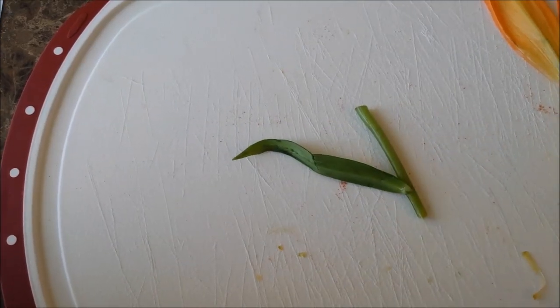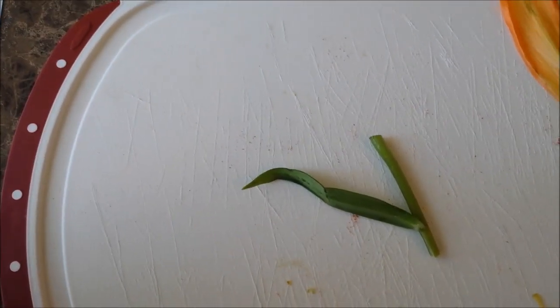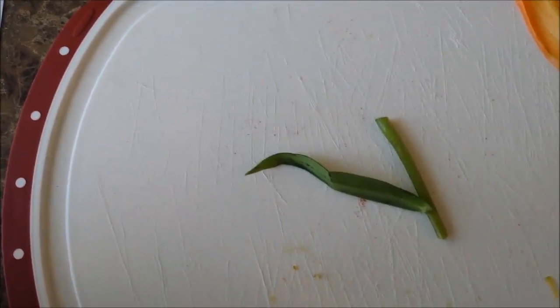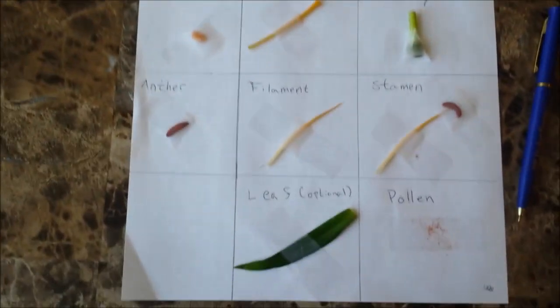Finally, we have the stem and the leaf. Not all of your flowers are going to have leaves on their stem, but if it does, go ahead and take that and you can attach that as well. So again, leaf and stem. Alright, so your dissection is now complete. You should have a full sheet of paper.